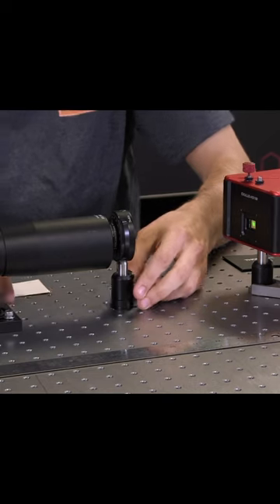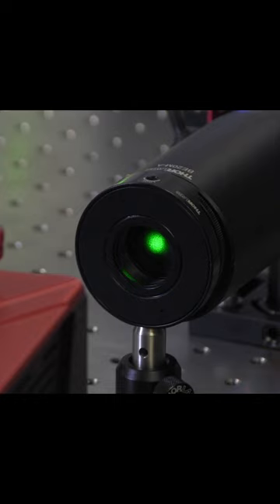Hello and welcome to Thor Labs. My name is Jack. I'm going to demonstrate a technique I use to calibrate a spatial light modulator, or SLM for short.